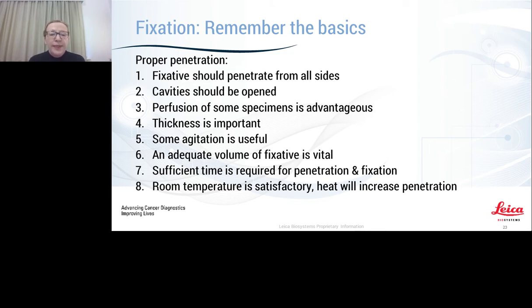So again, the basics. Remember proper penetration. The fixative should penetrate from all sides, so make sure that your container allows for that. Make sure that your cassettes allow for that. The cavity should be opened. If you have a large organ, make sure that you do open before fixation, or if it's come in, make sure that you inspect and open just to allow the fixative to get in. Perfusion of some specimens could be advantageous. The thickness of the specimen is very important. Some agitation is useful just to move the fluid around and allow for diffusion.